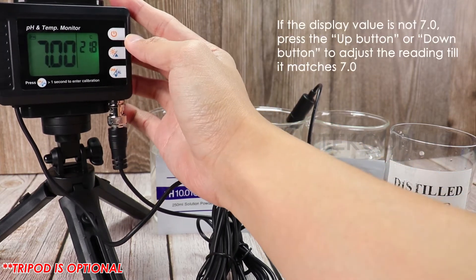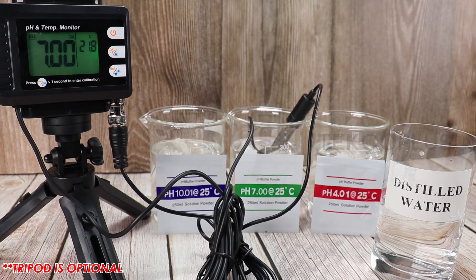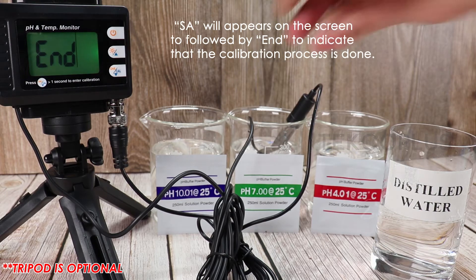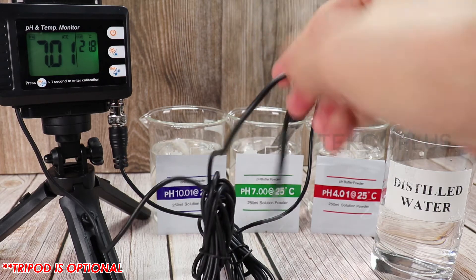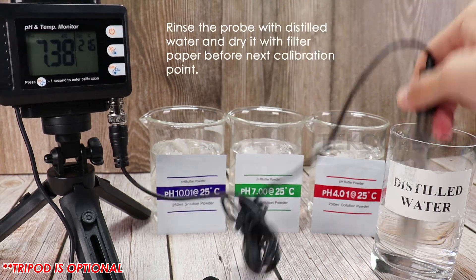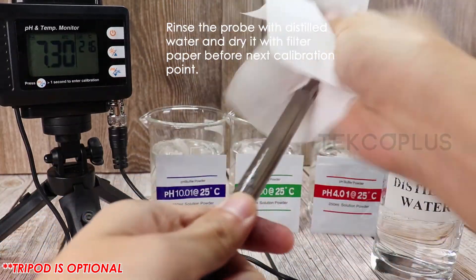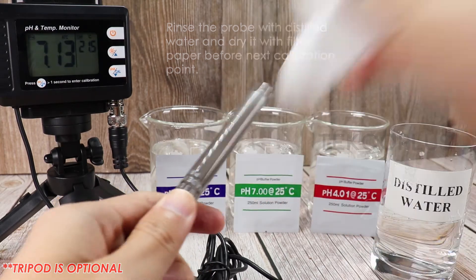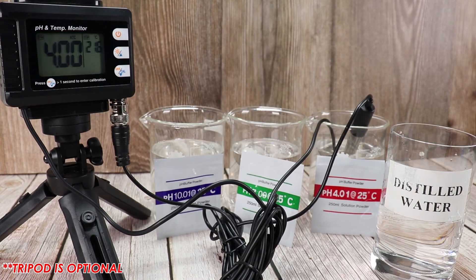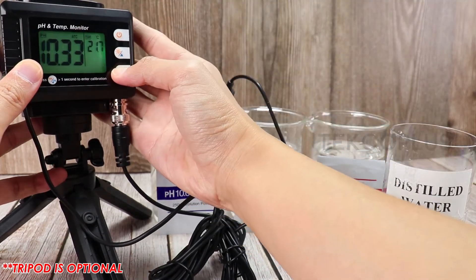Press the up or down button to adjust the reading until it matches 7.0. When the reading becomes stable and there is no operation, the meter will automatically save the calibration data within 15 seconds and exit the calibration mode. Rinse the probe with distilled water and dry it with filter paper before proceeding to the next calibration point. Repeat the process for pH 4.01 and pH 10.01. After calibrating to three solutions, calibration is finished.